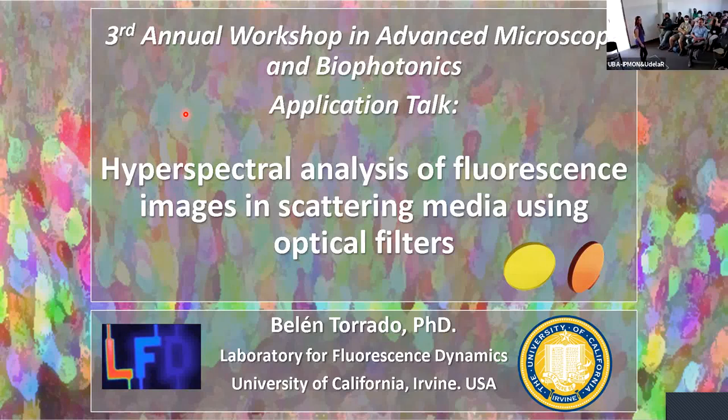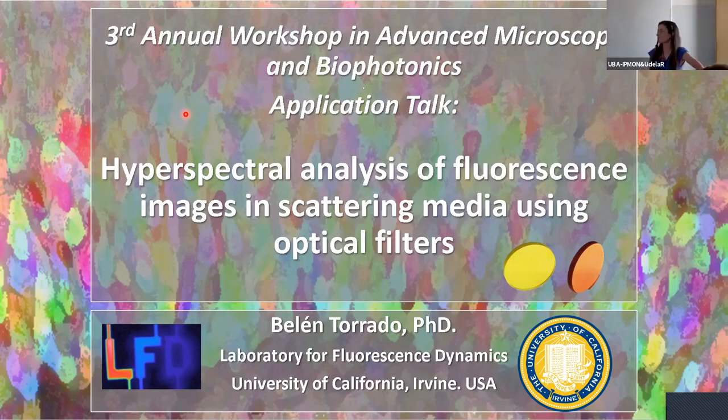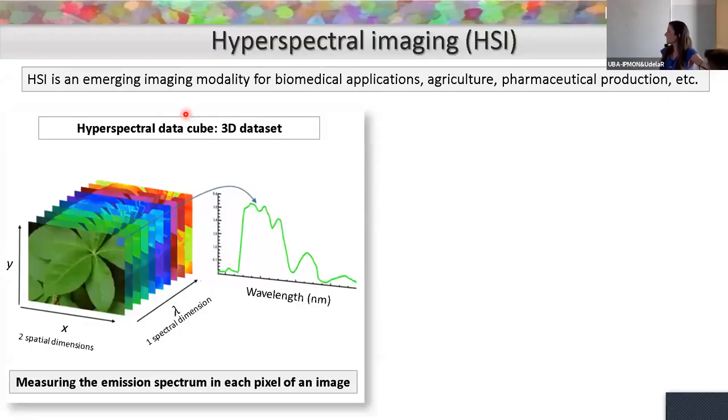As Lionel was saying, I'm going to present today a simple fluorescence imaging technique that allows hyperspectral analysis of images that are acquired in highly scattering media. You already have listened a lot about hyperspectral imaging, but I'm going to highlight some important points to show the method.